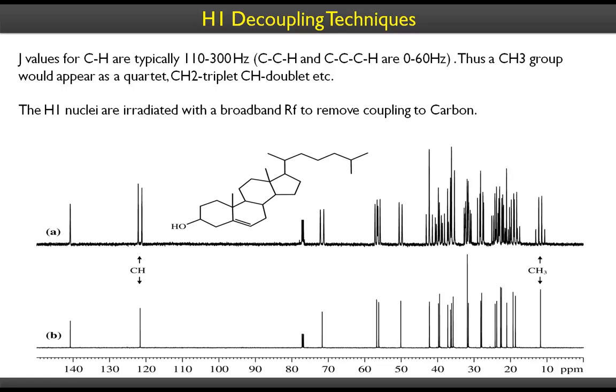We talked about homonuclear coupling, that is carbon-13 NMR coupling is not quite possible because of the low abundance and the remote chances that a carbon-13 nucleus would have another carbon-13 nucleus adjacent to it. Because the natural abundance of carbon-13 is only 1%, so only 1 in 10,000 molecules would have carbon-13 beside it. Then that's when it would couple, but that coupling would be going into the baseline or into the noise, so we will not see that minute residual coupling, right?